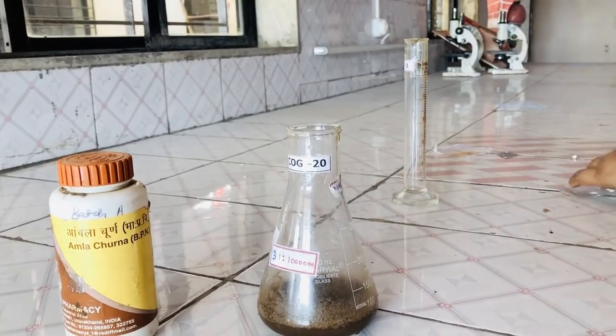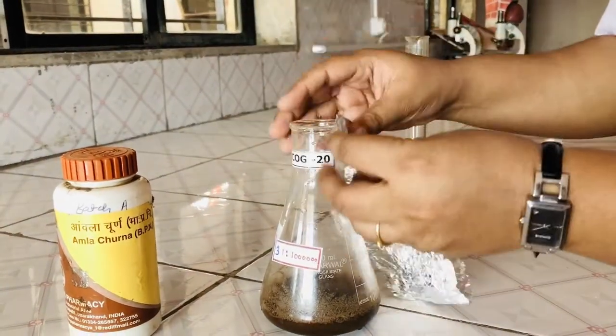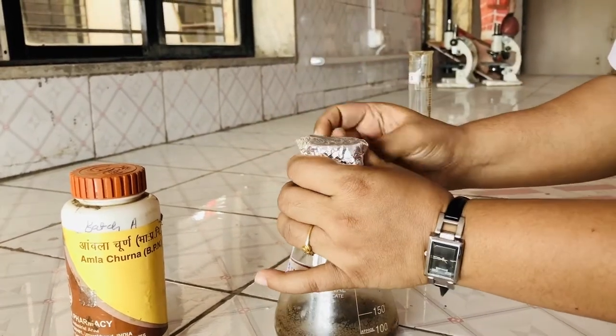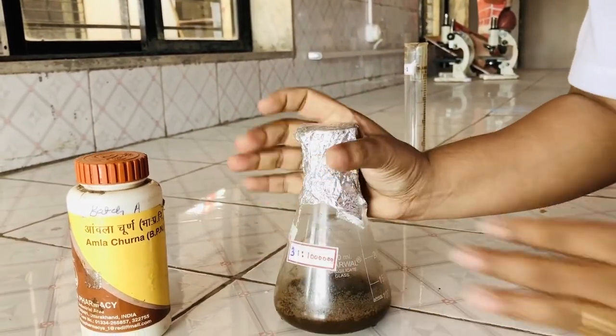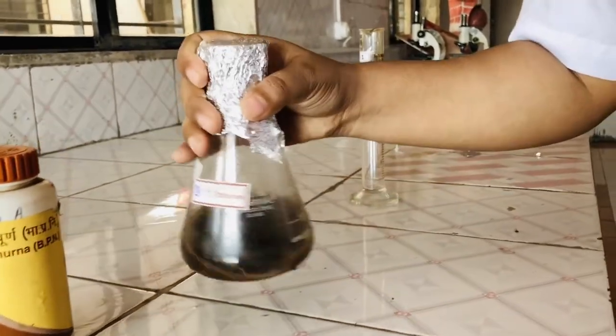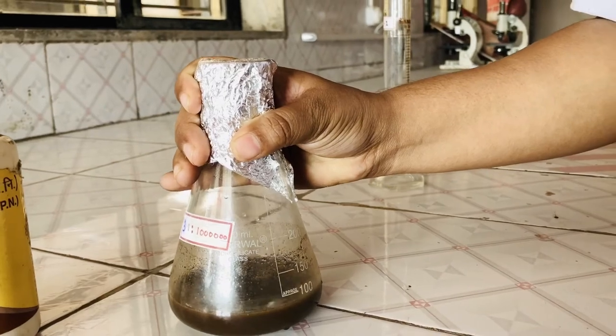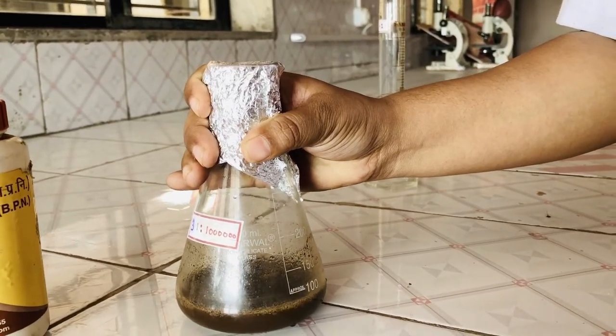Now we are covering this with the help of aluminum foil. You can also use a cork for this. You have to mix it properly and now we will keep this on the water bath for heating for the next 30 minutes.